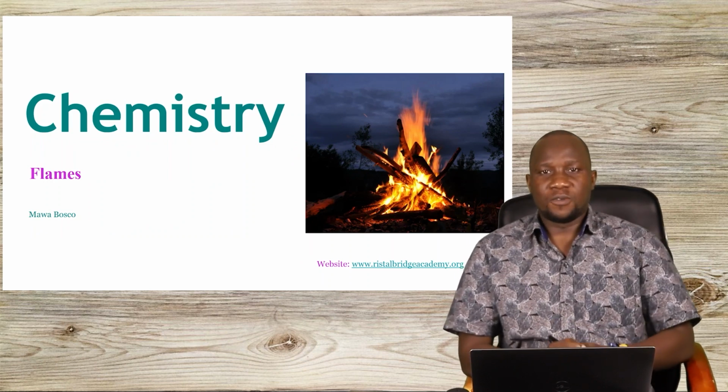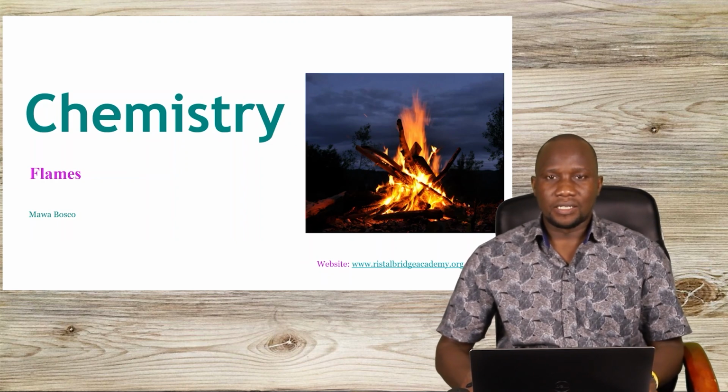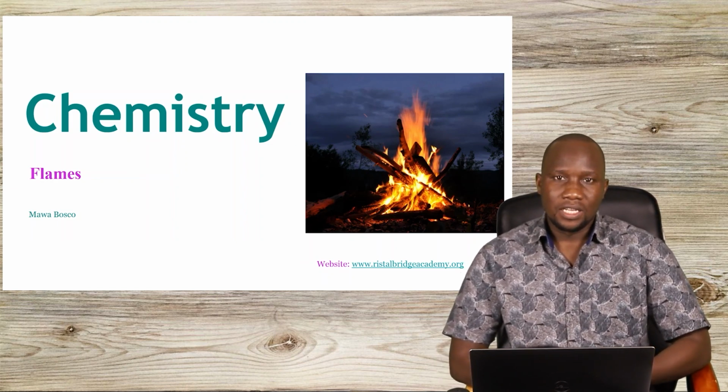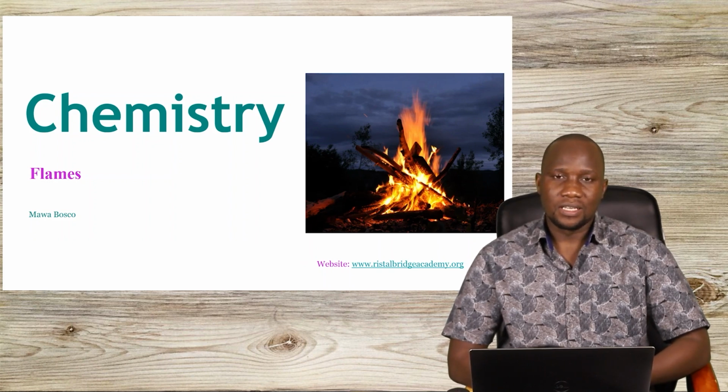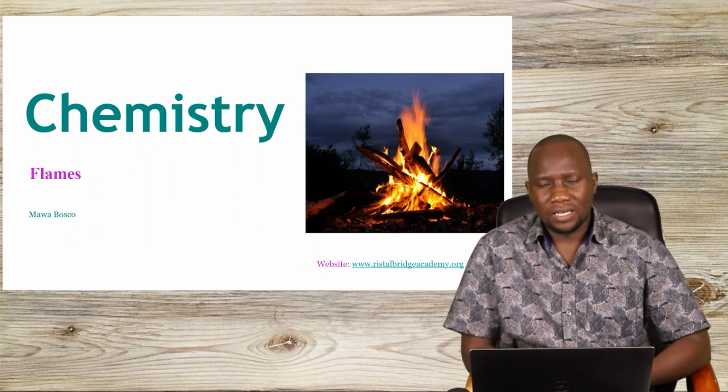So, welcome everyone. Let's look at flames very fast. Why do we want to look at flames? In the laboratory, we heat substances. So we heat substances. Often we use what we call the Bunsen burner.